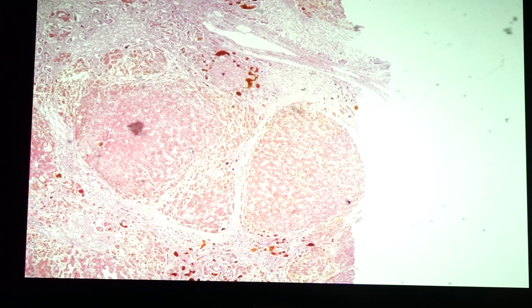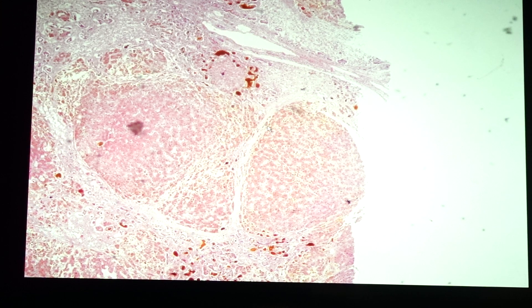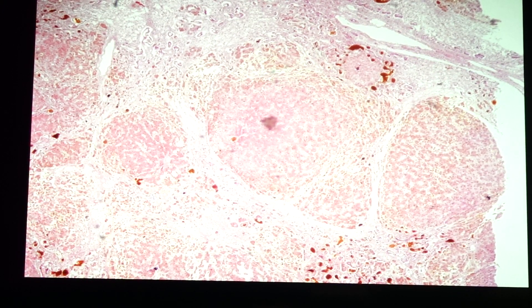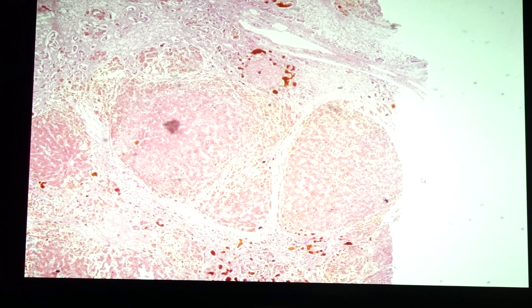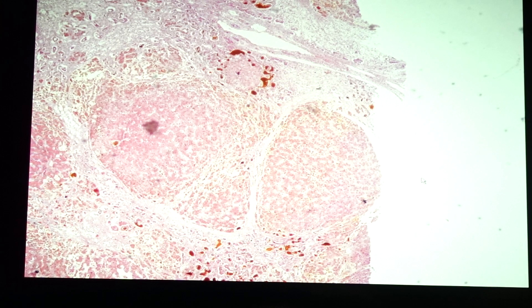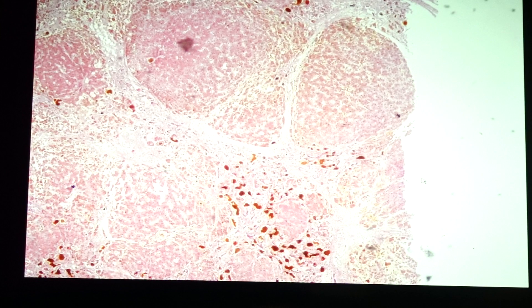Our first slide is slide 183, liver cirrhosis. Liver cirrhosis is characterized by the presence of nodular aggregates of hepatocytes that are separated by fibrotic stroma. One thing that makes this slide unique compared to others is the presence of bile lakes.